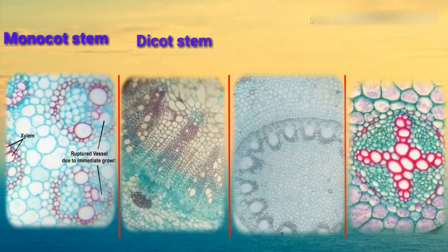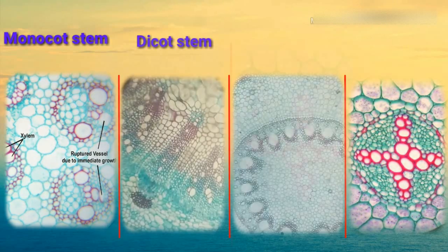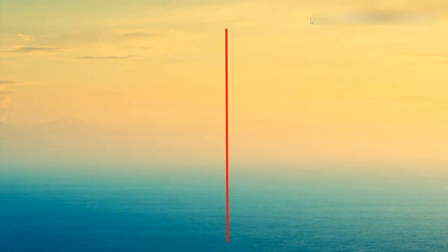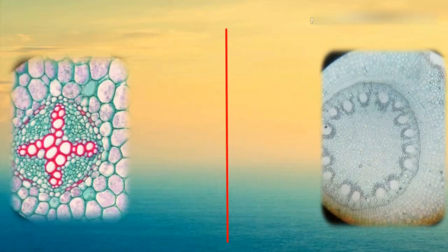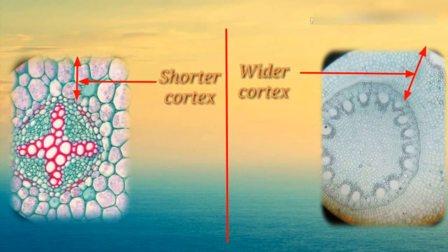Now from the remaining two, we will identify dicot root and monocot root. Generally, both of these look similar, but there are some major differences between them. We will distinguish them parallelly. Cortex is small in dicot root, whereas cortex is much wider in monocot root.